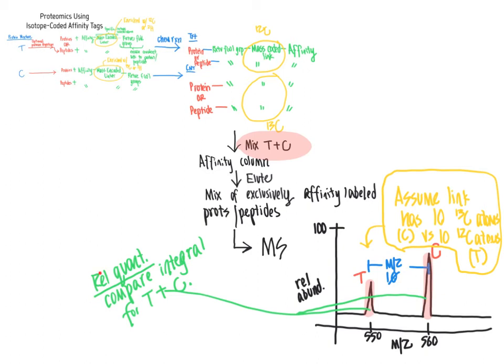And so this allows us to relatively quantify the treatment versus the control, and that is super valuable in terms of thinking about some of the fine scale changes that take place when a particular organism is in a disease state, or we're trying to determine the effect of UV radiation, or whatever other variable we want to explore the impact of on the proteome.